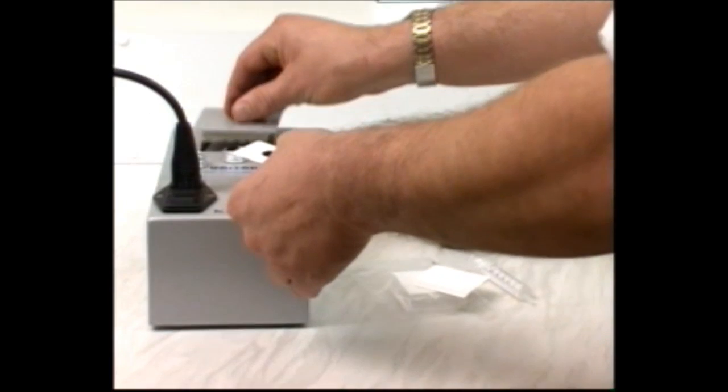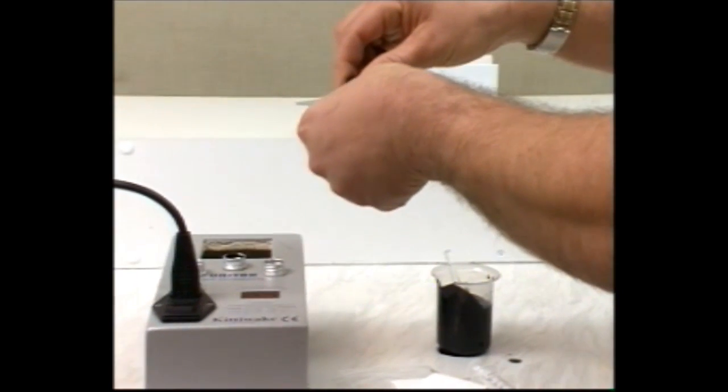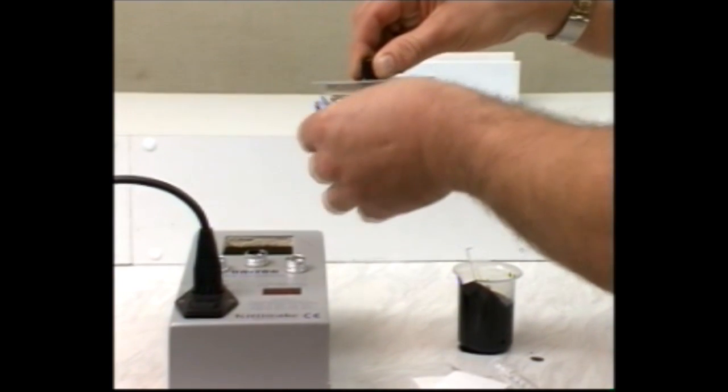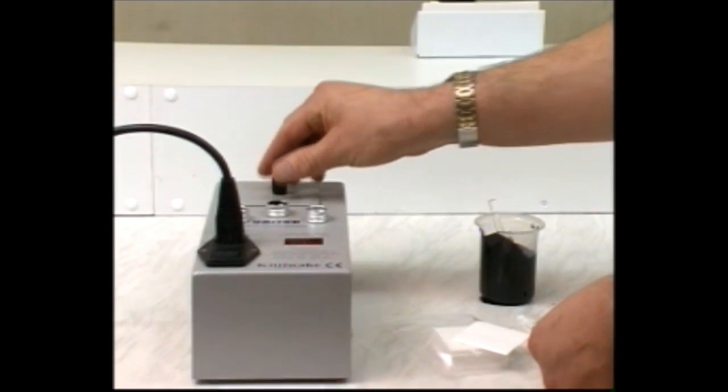Place the paper in the removable tray section and replace it in the oven. Reset the timer and wait for another 20 minutes while the spot dries and develops.